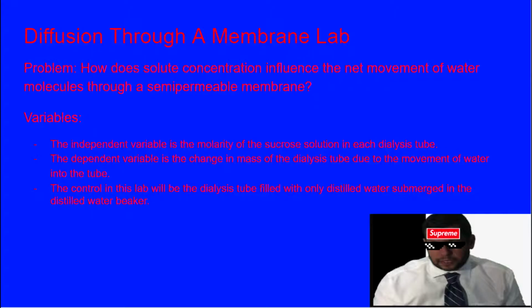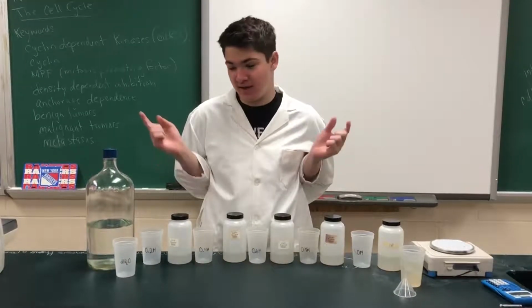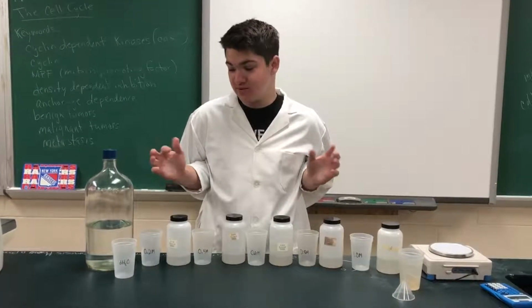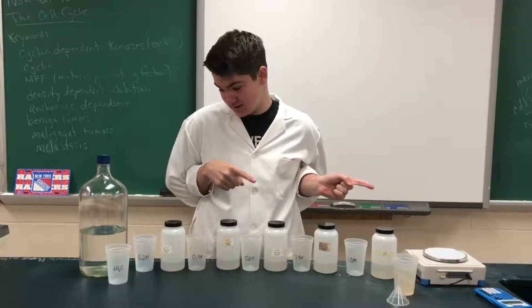And the control in this lab will be the dialysis tube filled with only distilled water submerged in the distilled water beaker. In front of me, there are the materials for the diffusion through a membrane lab. In this lab, we will use a canister of distilled water to my right.